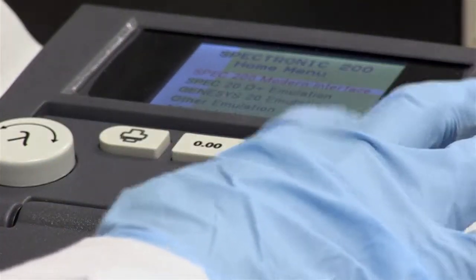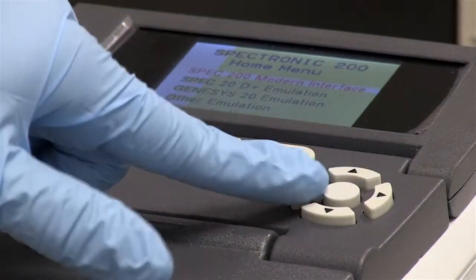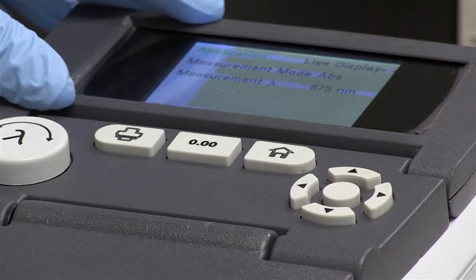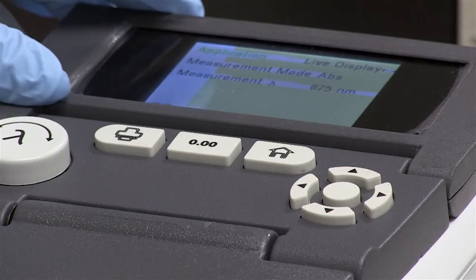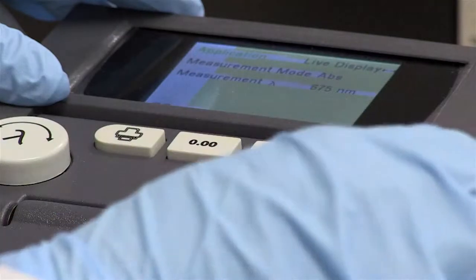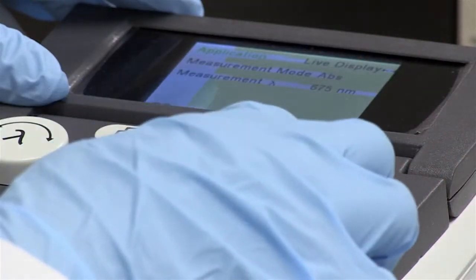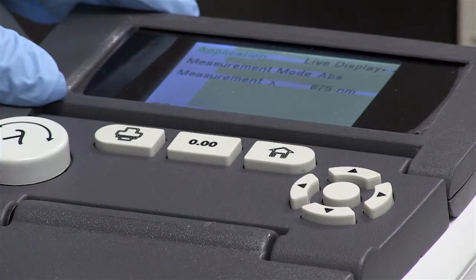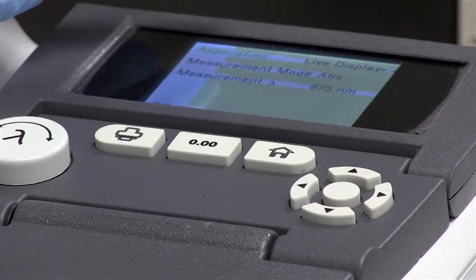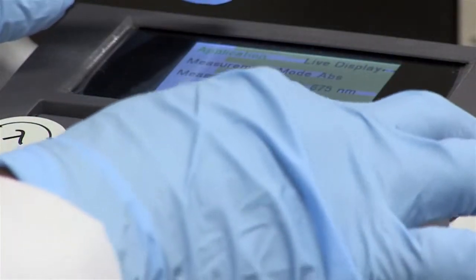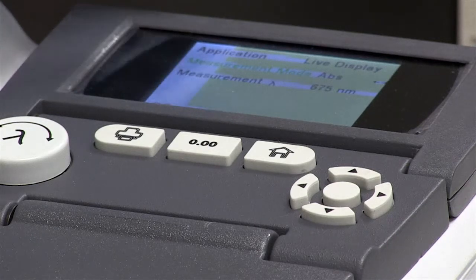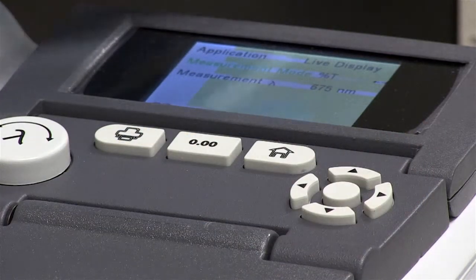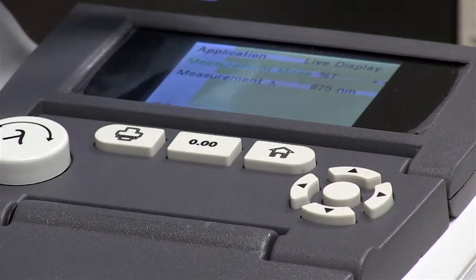The enter button is this circular button in the center of the arrow buttons. Pressing it gives us this display, and we're going to be measuring in the live display mode. We can either measure in absorbance or in percentage transmittance. If you want to change the measurement from absorbance to transmittance, press the right arrow and the sign percent T comes up.